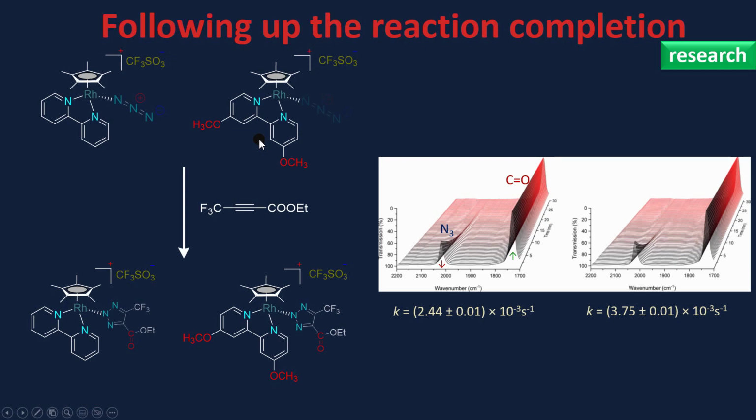Using IR a lot can be done. It's a great tool. But you also need the spectroscopy mindset. Another technique can also be used: the fluoro NMR, because the product has fluoro but the starting material doesn't.